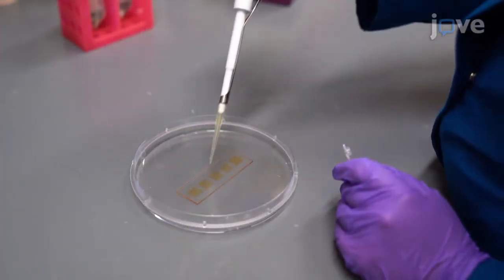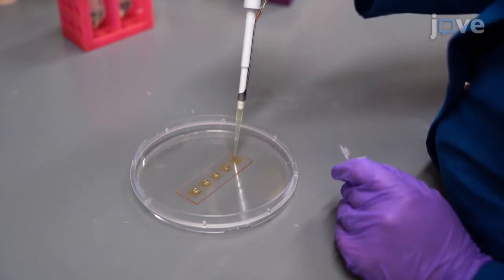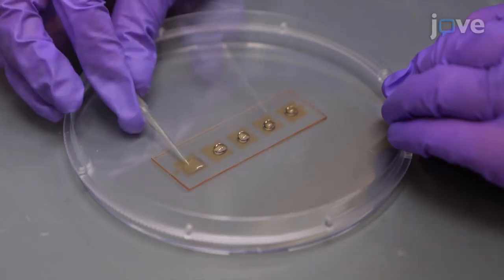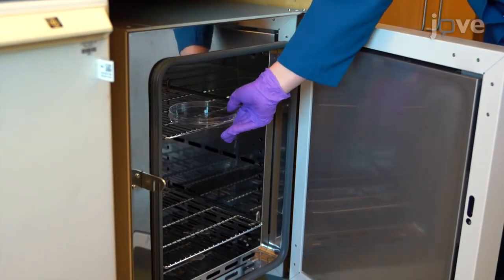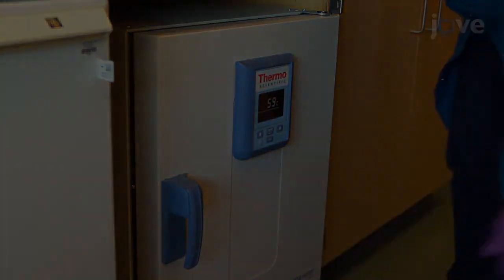Add a droplet of 20 micromolar amine-modified oligo solution onto each photopatterned region of the slide, and spread the droplet gently across the entire region using a pipette tip, taking care not to scratch the slide. Bake the slide in a 65°C oven until the DNA solution has fully dried.